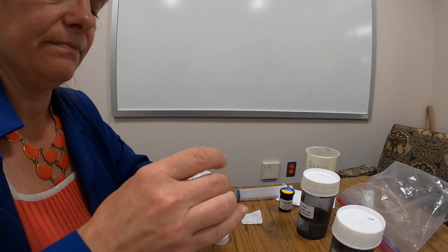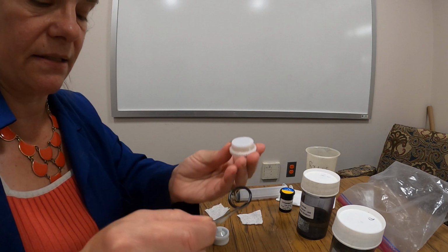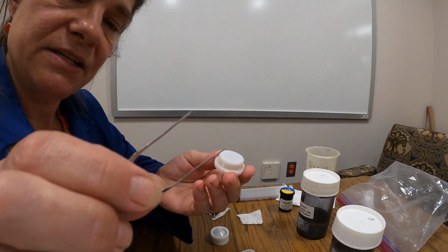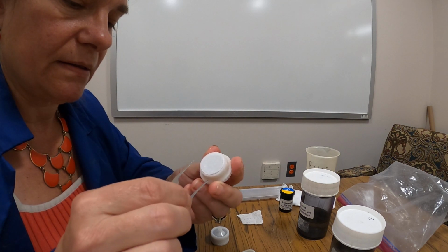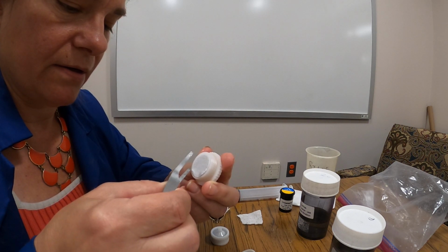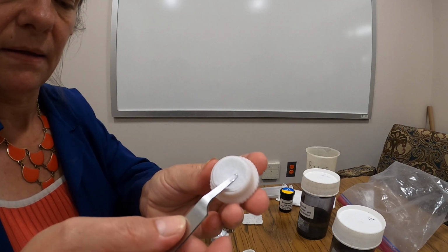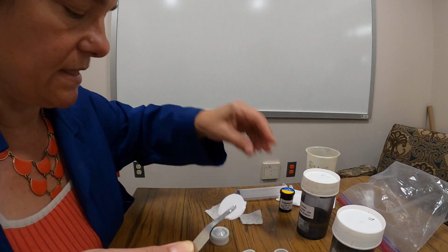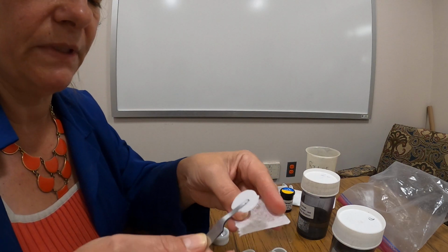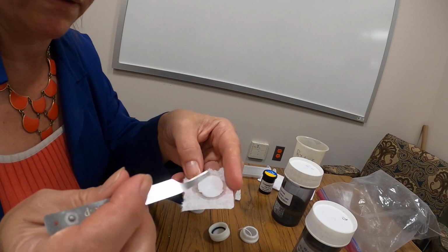I'm going to carefully unscrew my filter holder, remove the O-ring if it didn't stick to the top, and then using the edge of my forceps, I'm going to carefully get underneath my now wet filter. You can see underneath. I'm going to lift that up carefully. If you get some kind of breakage like that just did, don't worry about it. We'll get those pieces on there. So we're just going to take our filter, carefully put it in the middle of our blotting paper. And again, this can be coffee filter or paper towel.